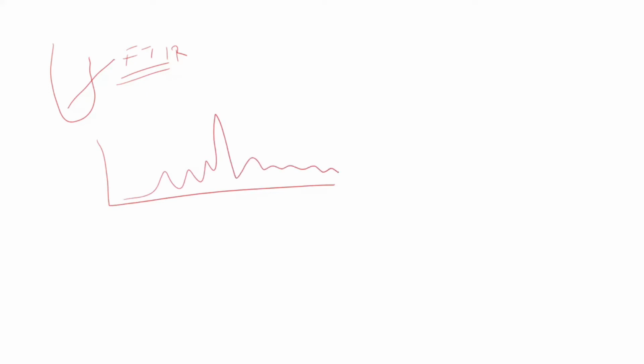So we have a reactor, and then we have some FTIR probe here. With the FTIR probe, we will have some IR spectra, something like that. And then we measure only one particular peak. I will send you an email with the wave number of this particular peak; I forgot at the moment. And then what we do is, you have time, and then you have the intensity of this particular peak.